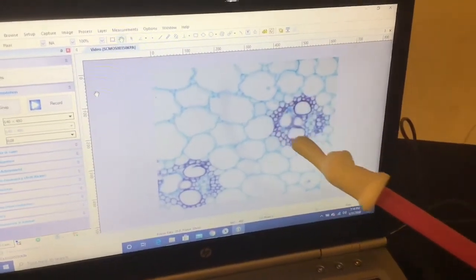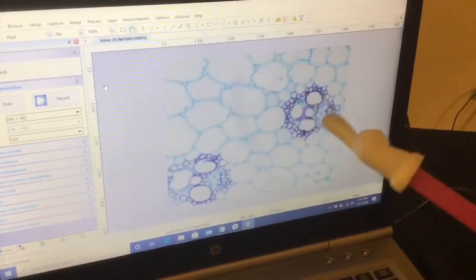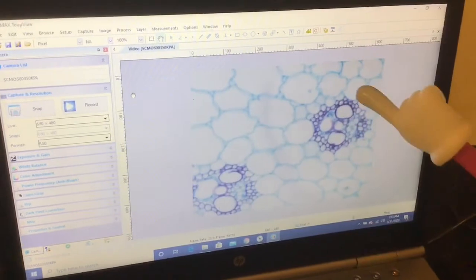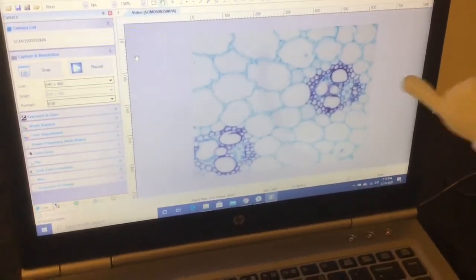This is your fibrovascular or vascular tissue, the fibrovascular bundle with vascular tissue in it, in the cross-section of the stem of the plant, bringing nutrients up from the soil and also helping transport products that the plant makes to different parts of the plant.